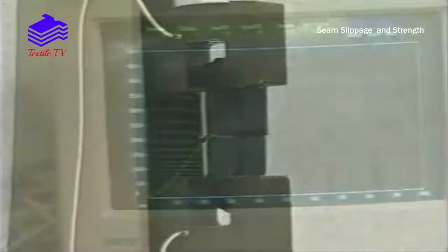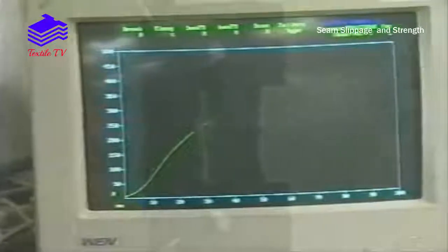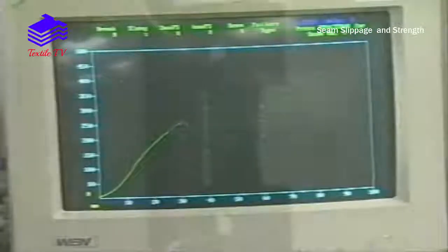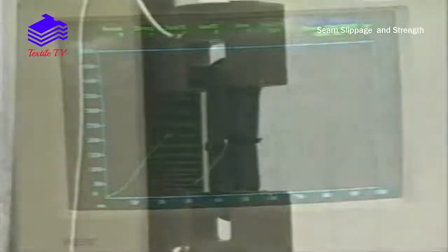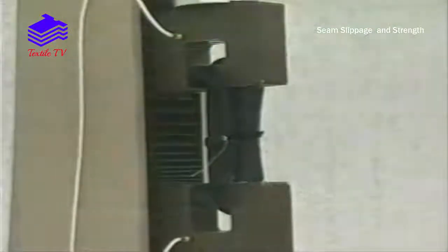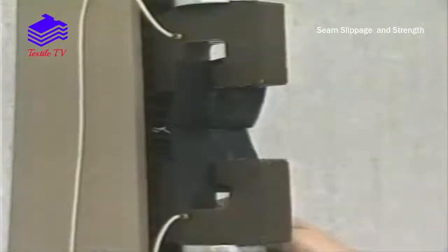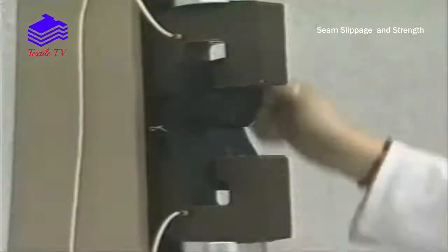The computer will record the data as seam slippage and seam strength. This process is continued until all the specimens have been tested.